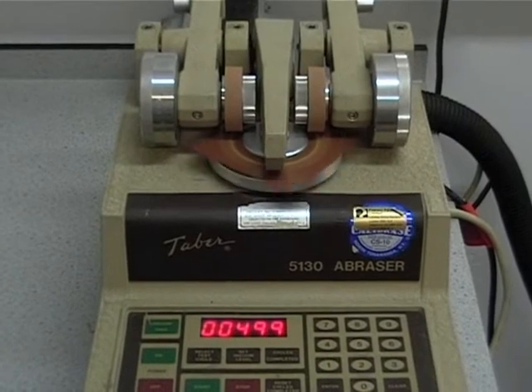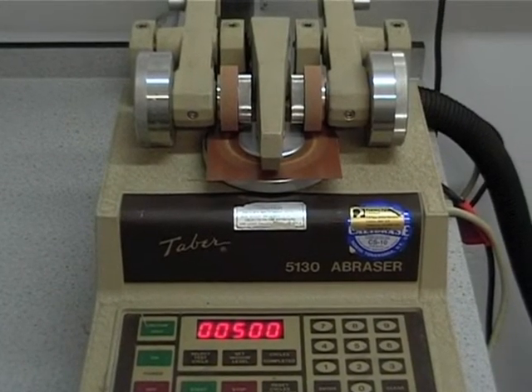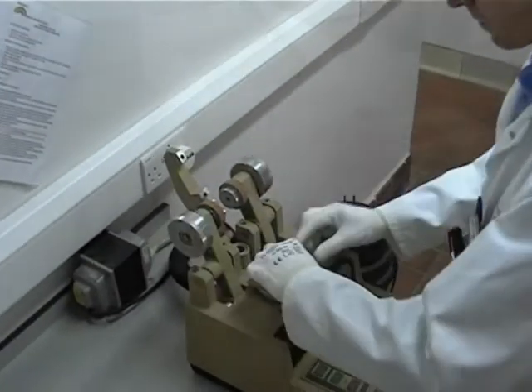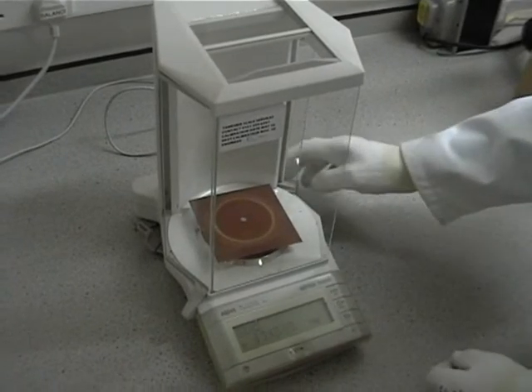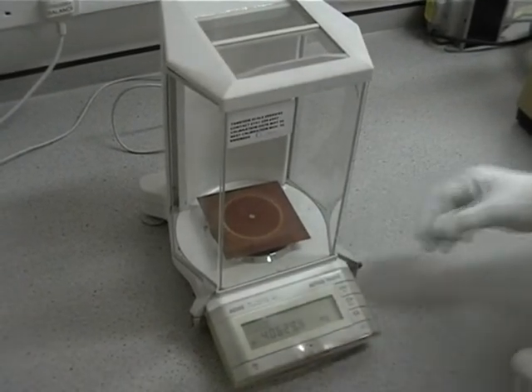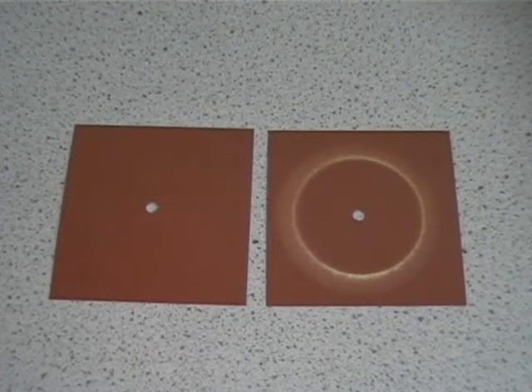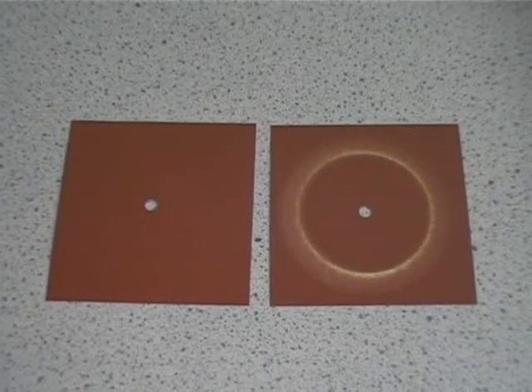After the set number of cycles, the machine stops and the sample is removed and re-weighed. The difference in weight is noted and the result is expressed as the weight loss under the set conditions. For this example, that was 52 mg after 500 revolutions with 1 kg weight.